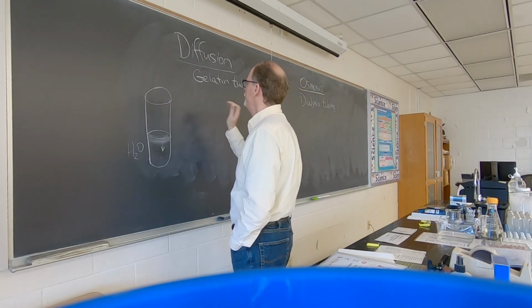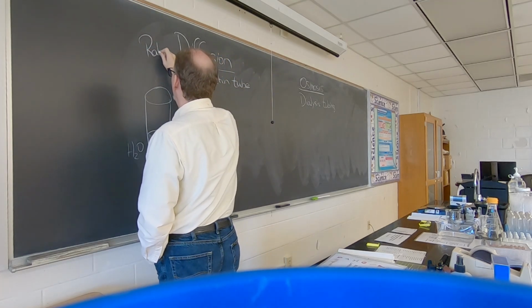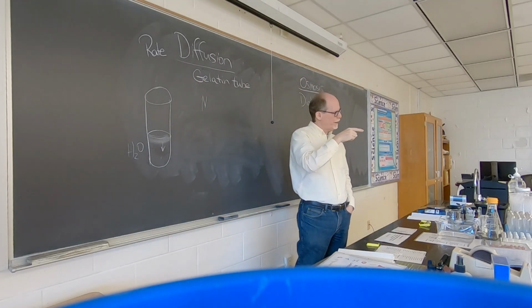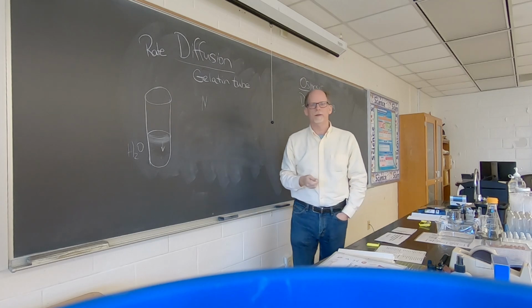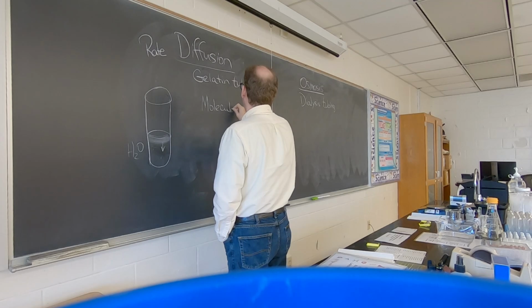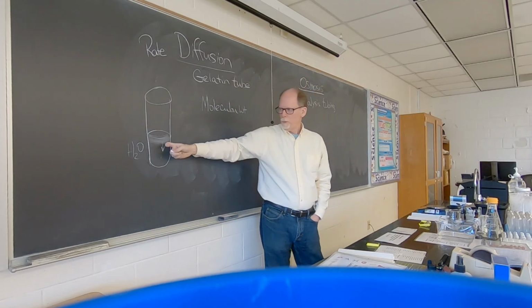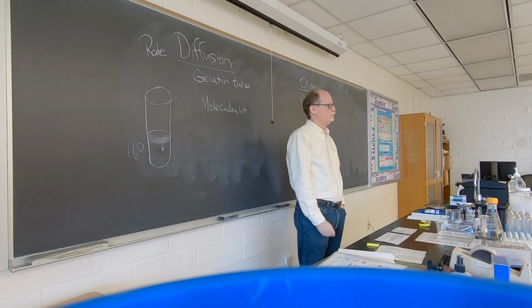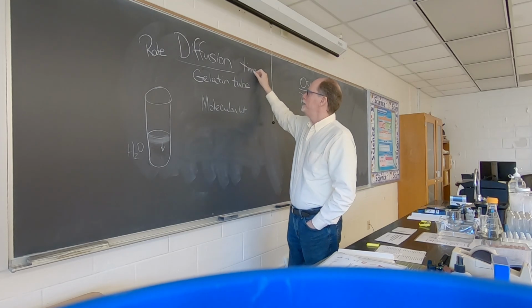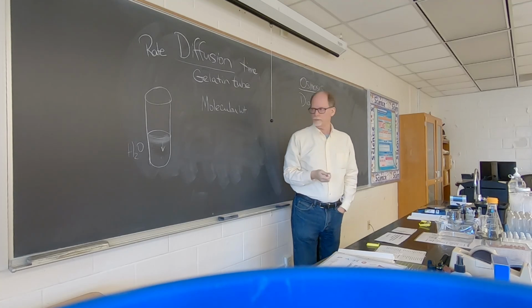Now there's a couple things that affect the rate of diffusion. The rate means how far the dye or something diffuses in an hour or a minute or something like that. So the molecular weight influences how quickly these dyes move. So when something diffuses, it takes time, and it also takes some temperature, right?